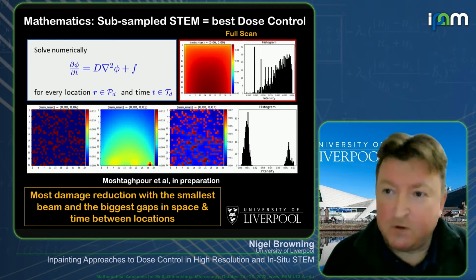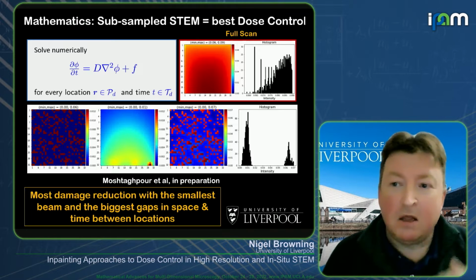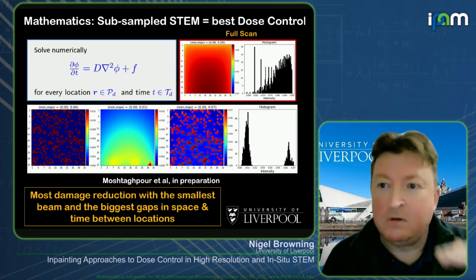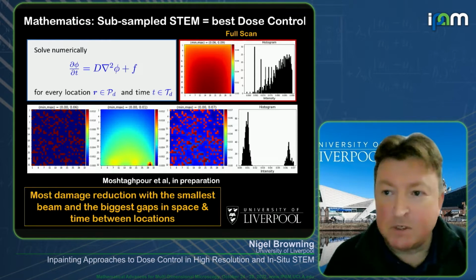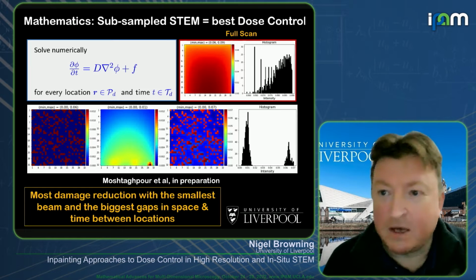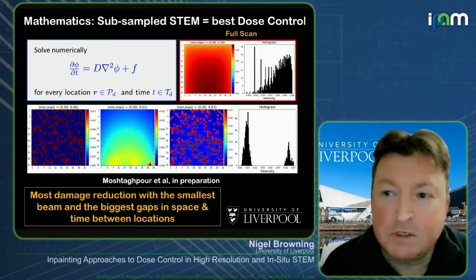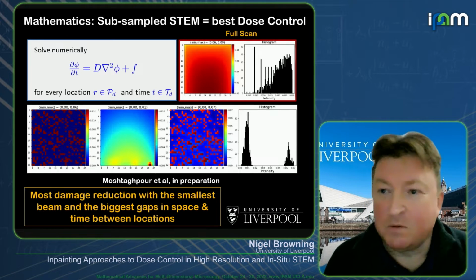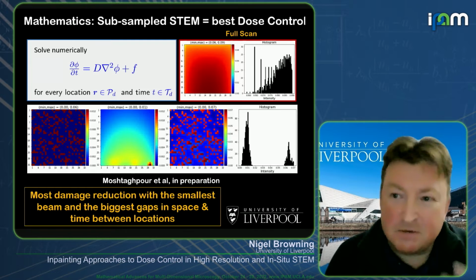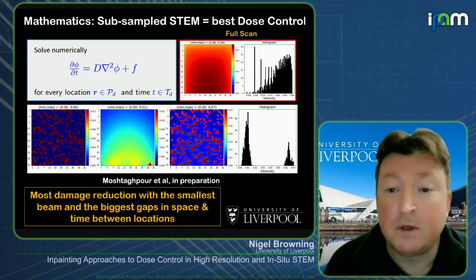Supporting this idea of diffusion being important in terms of what is happening to damage, a lot of the people that have tried pulsed electron beams to look at the damage in liquid cells and in materials find that there is a healing effect that takes place. You pulse, you wait, you pulse again, and your cumulative dose can be a lot more than what you would have with a continuous beam. And that's a very similar kind of idea to this, which is that the diffusion can propagate away and you're not hitting on top of the whole thing.